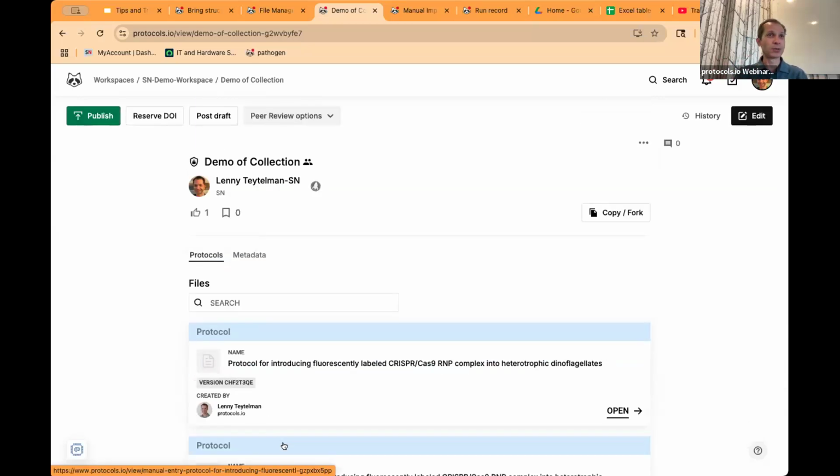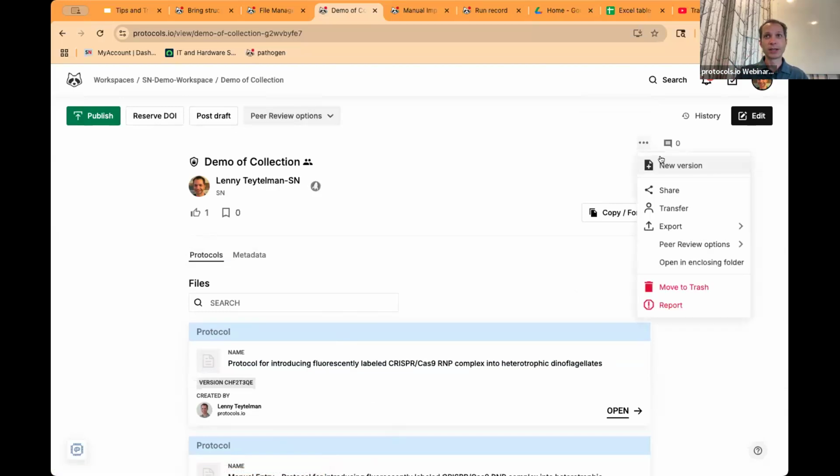So this makes your papers look nicer and saves some work for you if you're trying to share things instead of sharing them one by one, right? But all of the same features in the editor apply with the exception of the step-by-step component and components inside them.